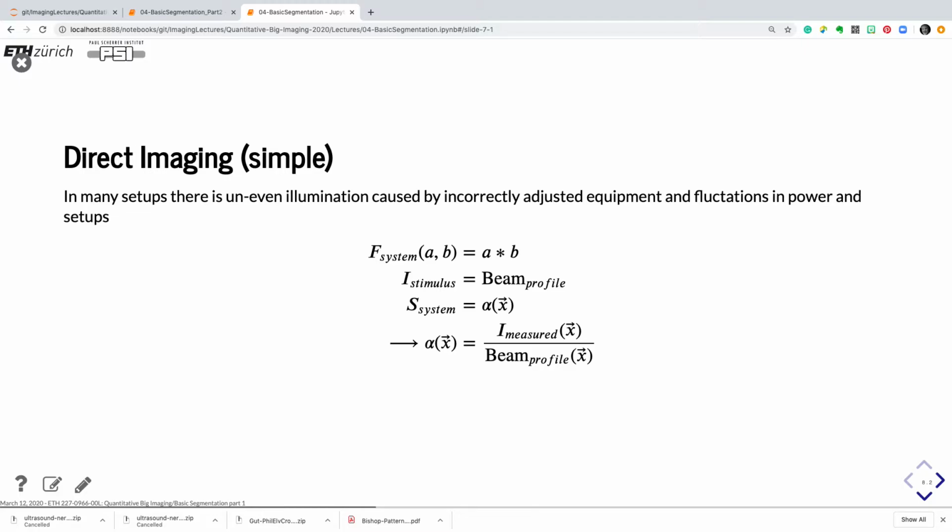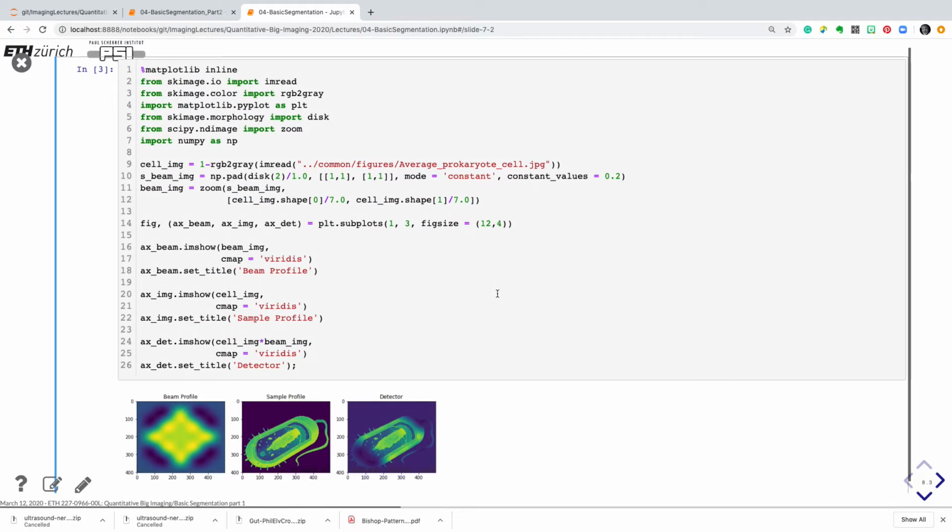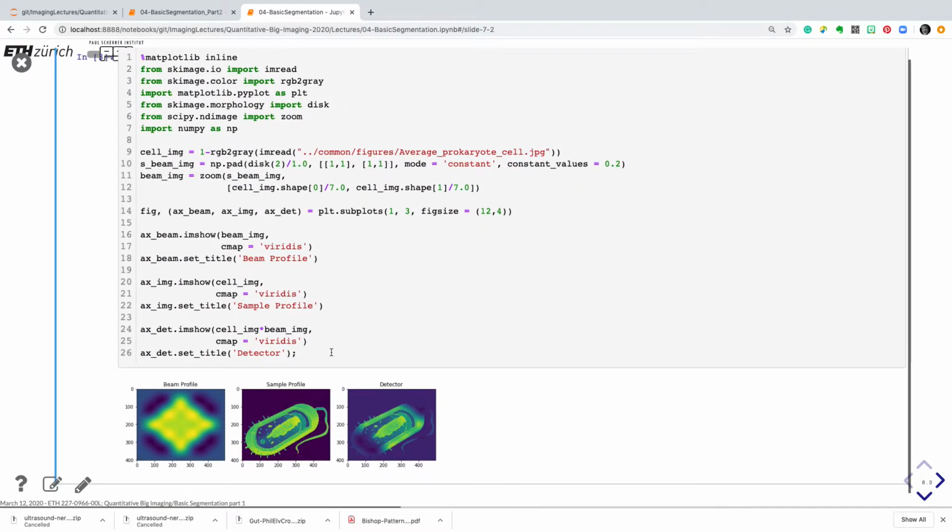For example, with neutrons, we have a huge amount of scattering, which is actually the main reason why the neutrons don't reach the detector. And they can be pretty annoying because they come back to the detector again, and not as structured as if they went through the sample. So let's look at a little example down here.